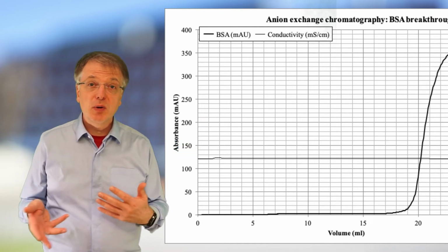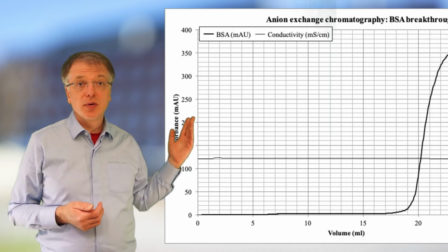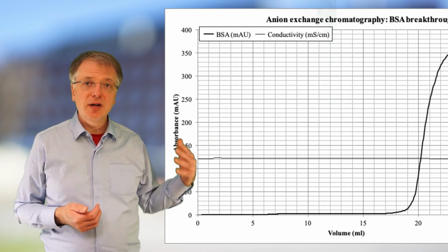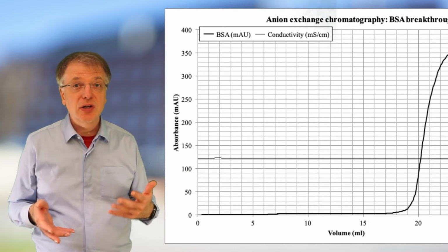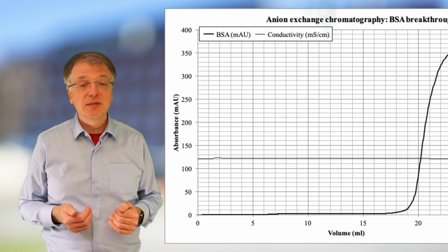A first approximation of the degree of utilization would be to divide the breakpoint TB with T star. But if we do that, we assume that the area below the breakthrough curve up to the breakpoint is negligible. Better would be to actually calculate the area below, that is how much has come out at TB.